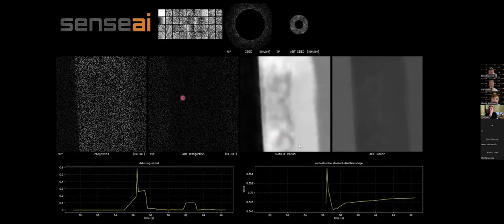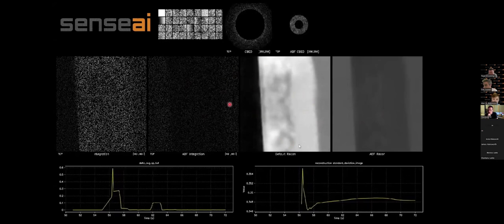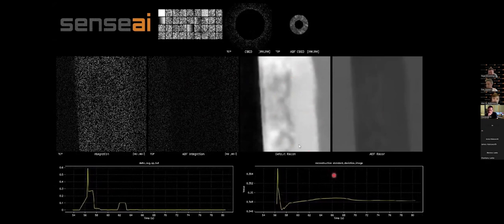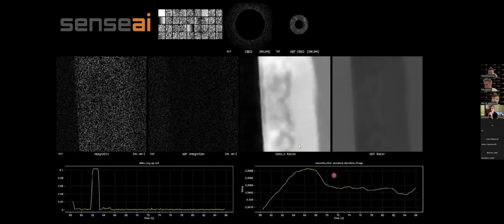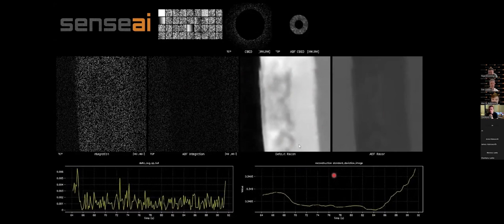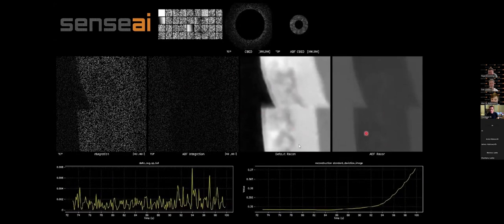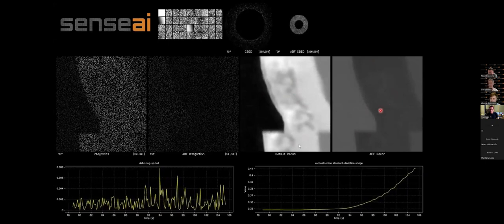However, with the ability to form multiple different images within the same acquisition, we can also then make alignment adjustments. When you typically operate on a STEM, especially at high resolution, the quality of your images at the low scattering angular range, that is on your bright field, requires slightly different alignment parameters to that for dark field. So we can now actually adjust and change our focus, our alignment conditions based on, in this case, our low angle dark field, which is this one here, and our annular bright field, which is this one here, all within one data set. So we can try and tune both at the same time.